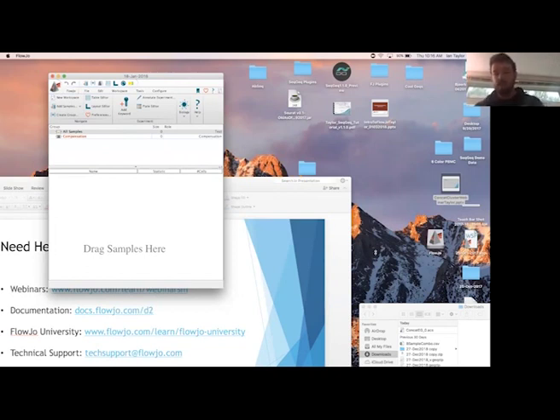You guys are coming up with great questions. Another user's asking, why use uncompensated when concatenating? Yeah, so as I mentioned, I kind of brushed over this, but if you have an acquisition-defined compensation matrix, then what you really want to utilize is that acquisition-defined matrix in your concatenated file. And if all of the data files share the same acquisition-defined matrix, then post-concatenation, you'll still have access to that acquisition-defined matrix through the spillover keywords in your data file. So that's why I used uncompensated parameters for concatenation.